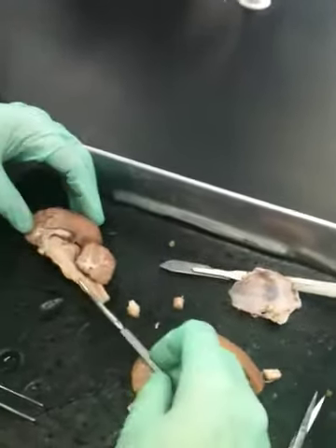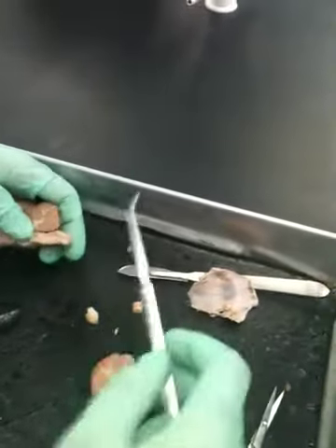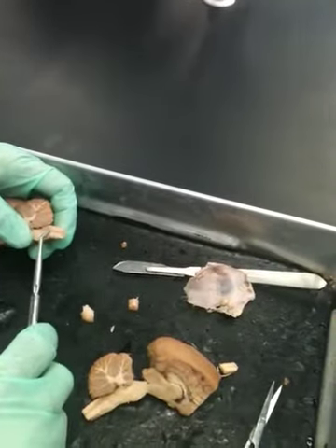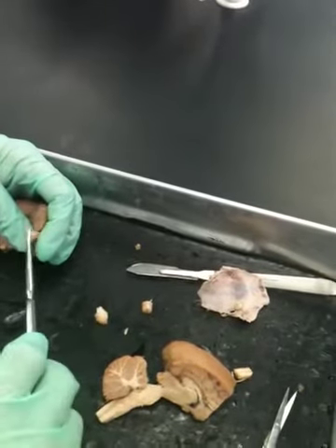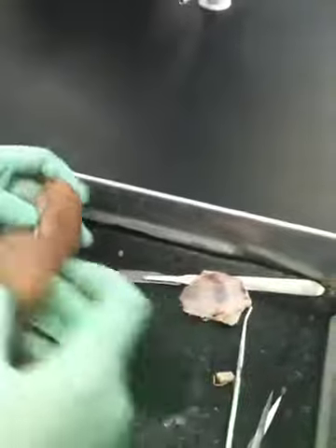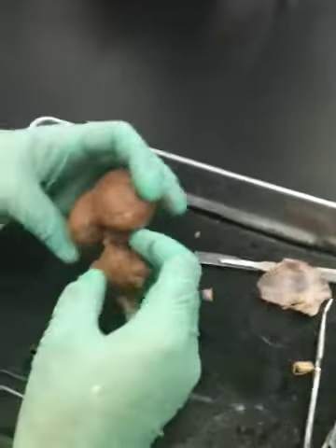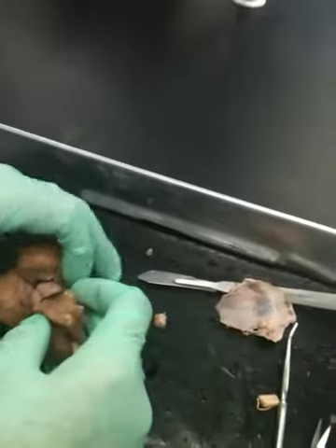Medulla oblongata, right? Midbrain's up here. Okay, you're in the spinal cord, and so you've sliced through the spinal cord, and you went through the gray commissure. So see the gray matter? And then the white matter columns. When you look there, you can see half your butterfly. You stick them together. Baby's butt sitting on a chair.